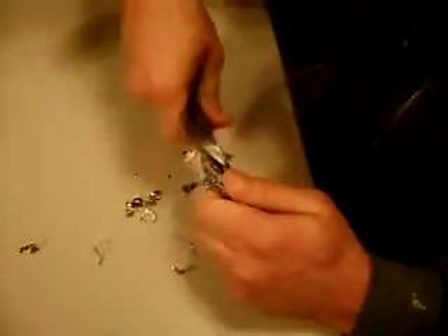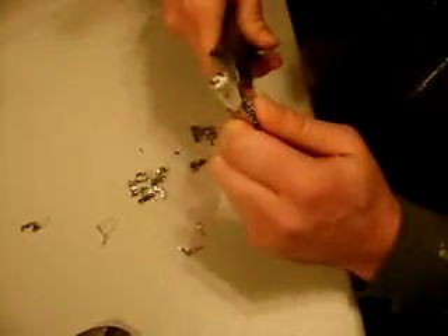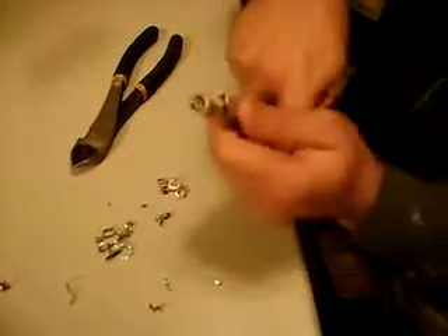Another good thing about wearing gloves is it protects you from getting cut. I'm getting cut right now. Now you can smell the alkaline solution. Clean up a little blood mess here.